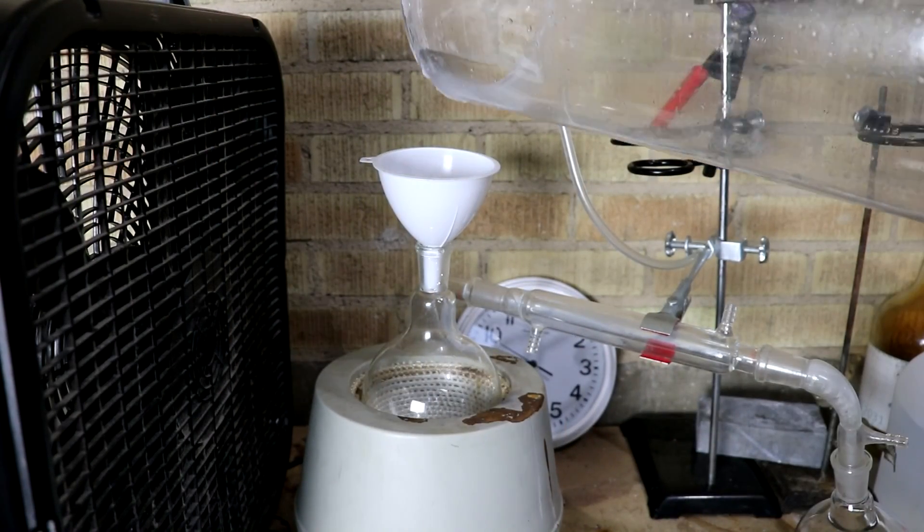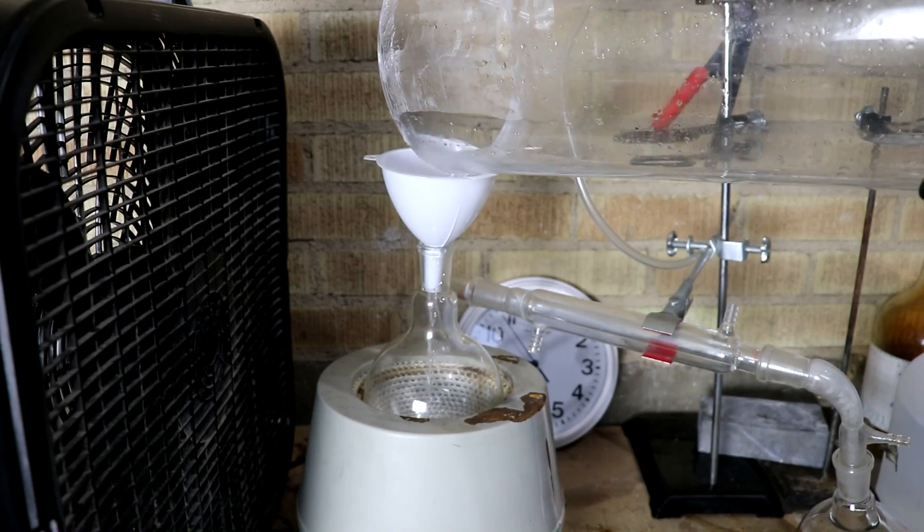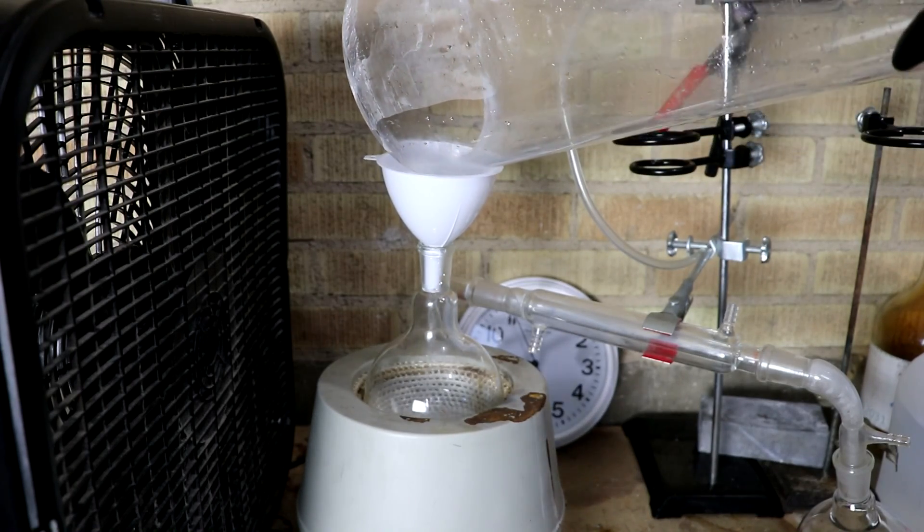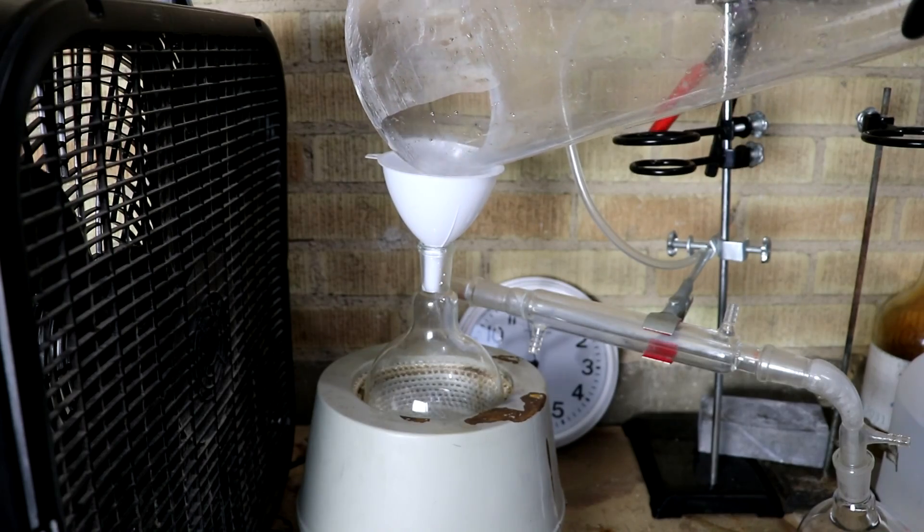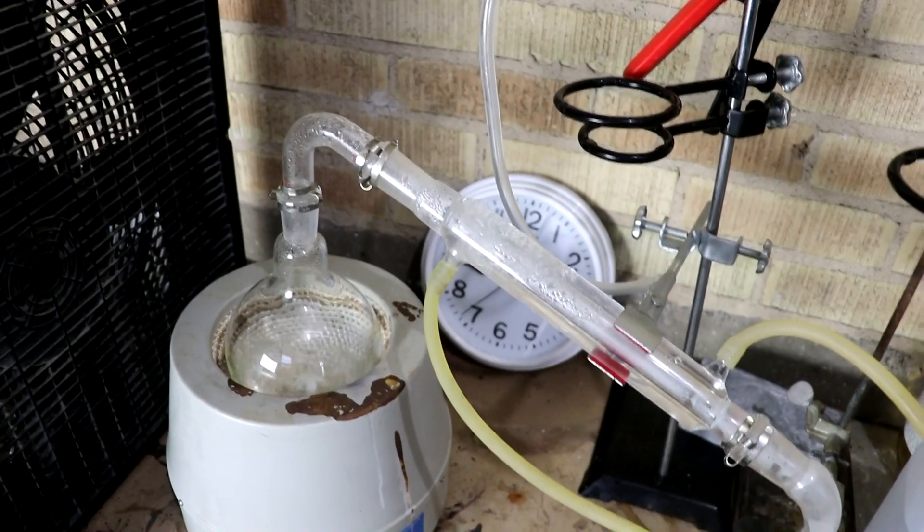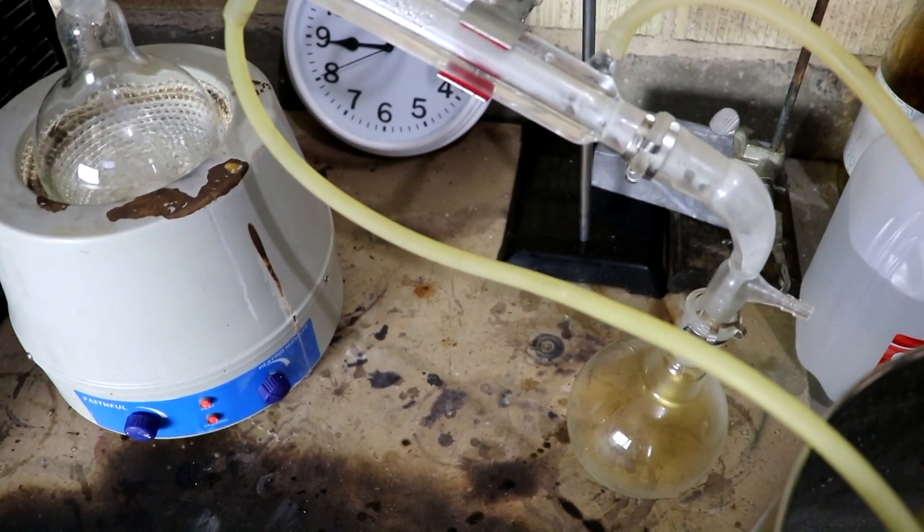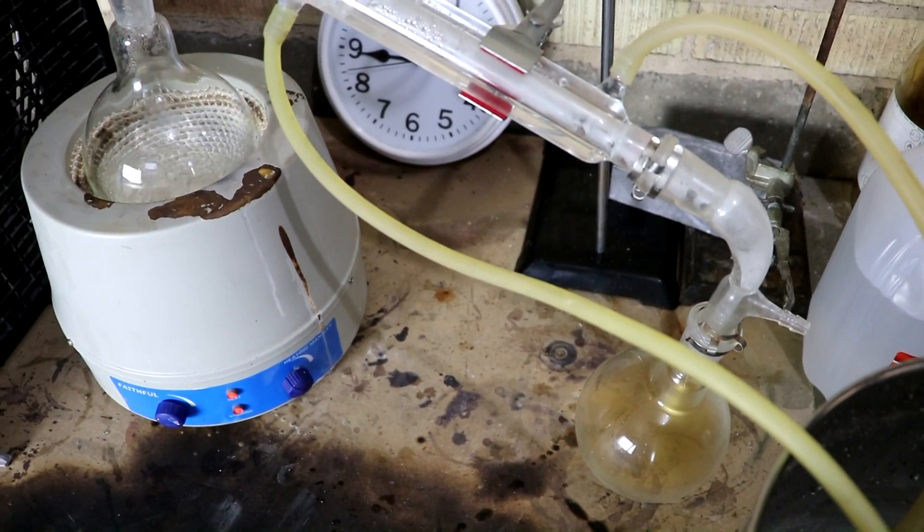Okay. Let's pour our crude acid into the distillation apparatus. Let's throw the stir bar in there with it. That's fine. There we go. Distillation has started. The water's coming over. And the nitric acid should be coming along with it.